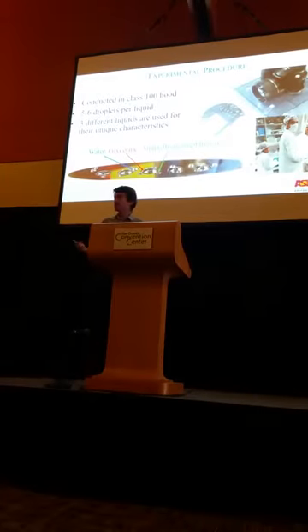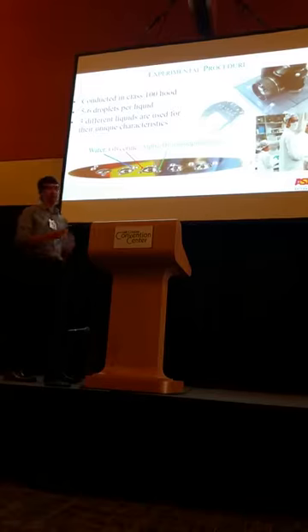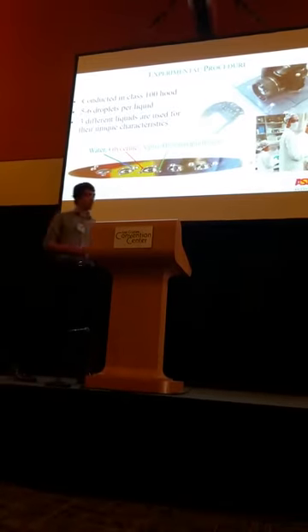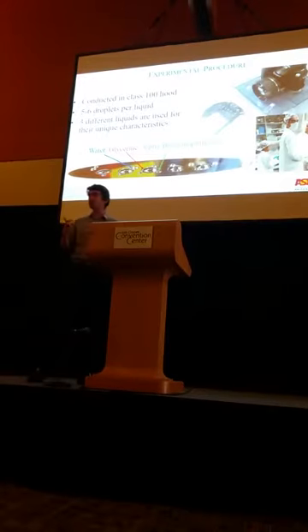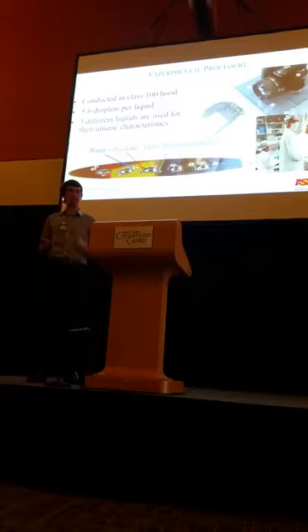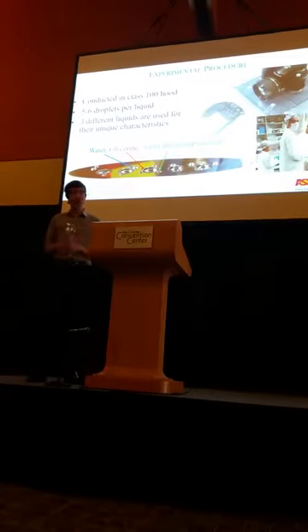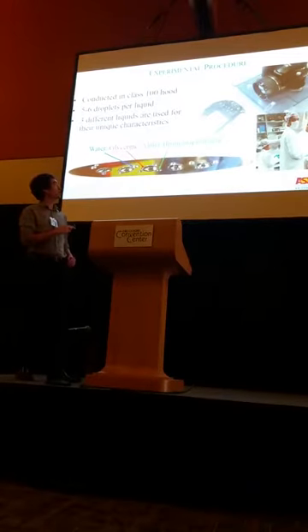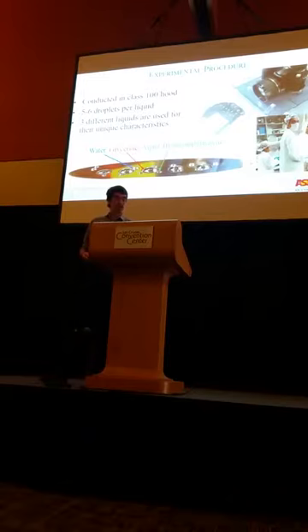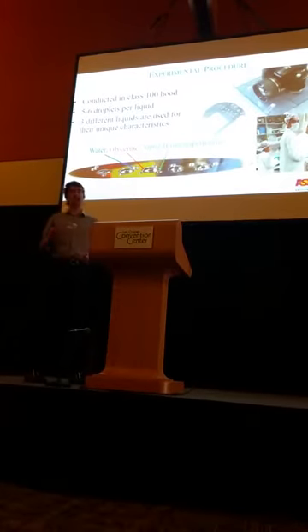We use 5 to 6 droplets per wafer, per liquid, in order to get many results to further refine our measurement. The volume of these droplets is only a few microliters in order to reduce the effects of gravity flattening out our droplet. We also take these pictures very quickly after the droplets are placed in order to reduce the effects of evaporation.